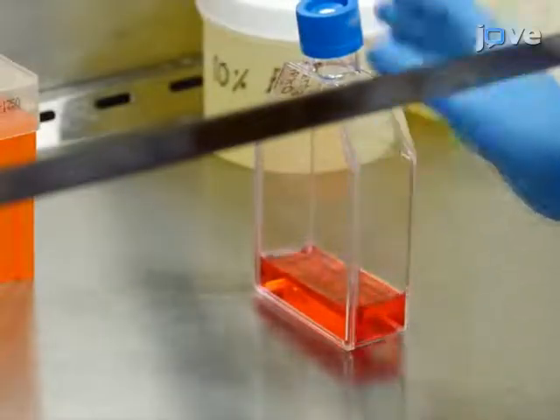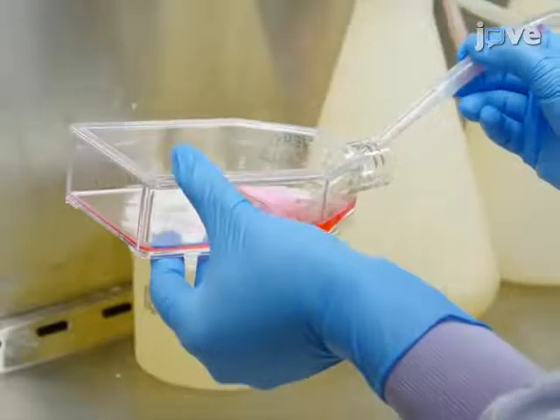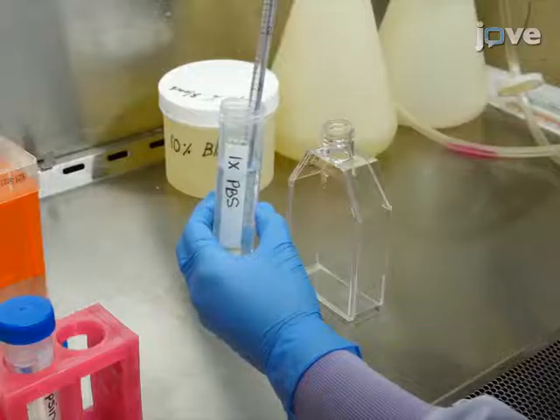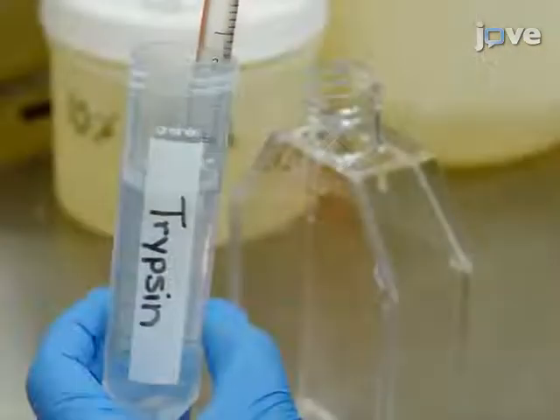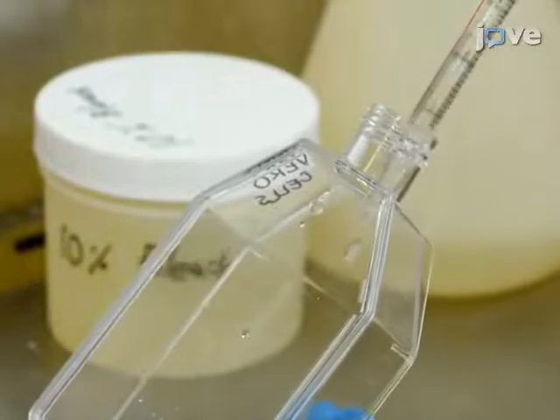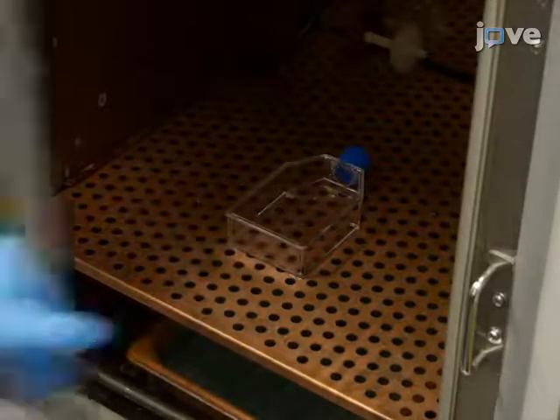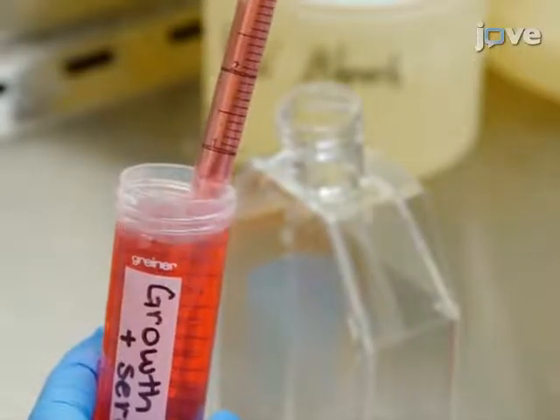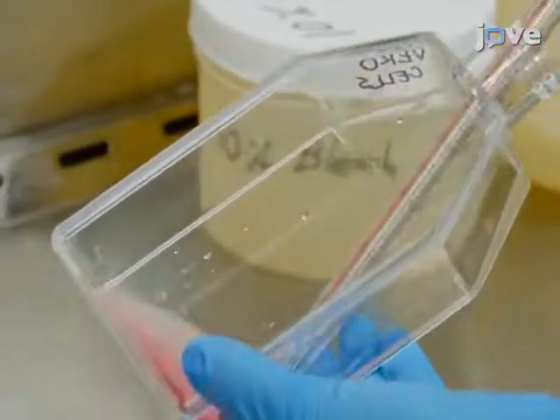Begin by harvesting Vero cells at 80% cell density in a T75 culture flask by aspirating the medium from the flask and rinsing the cells with 2 milliliters of phosphate-buffered saline. Add 2 milliliters of 0.25% trypsin and incubate the flask at 37 degrees Celsius for 5 minutes. Following the incubation, add 8 milliliters of growth medium containing serum to inactivate the trypsin.